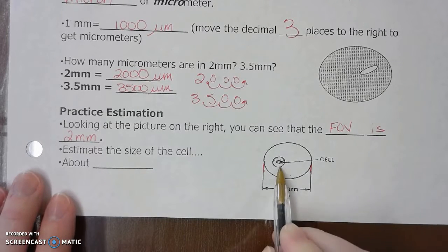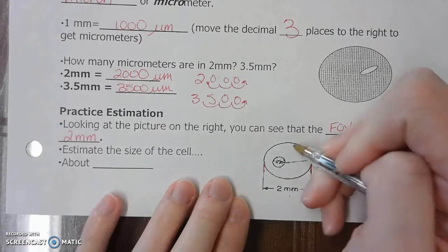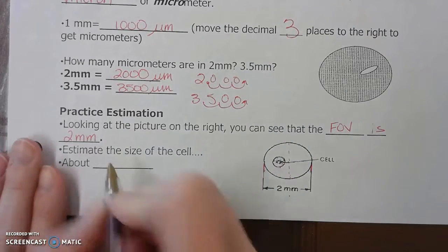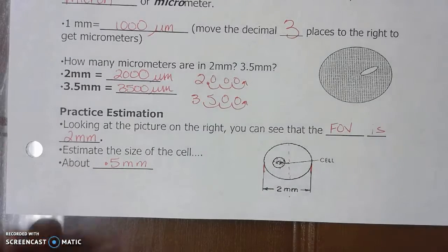So we need to estimate the size of this cell. When estimating, I like to cut the field of view in half to start, which means this half is 1 millimeter and this half is 1 millimeter. Now this cell is less than 1 millimeter. So it is approximately half of that, or 0.5 millimeters.